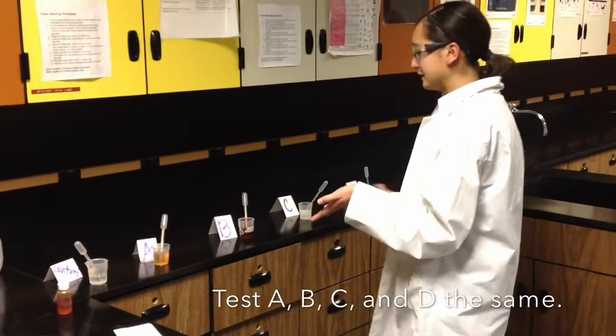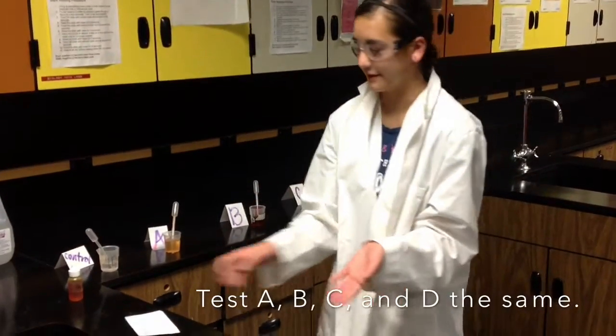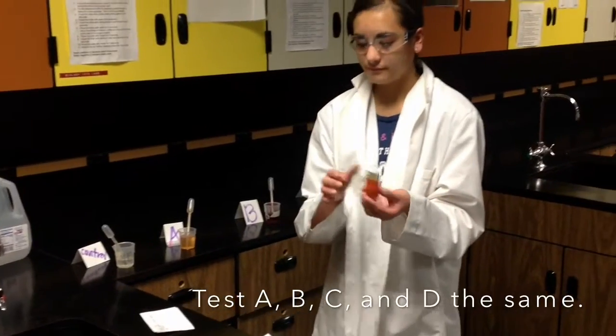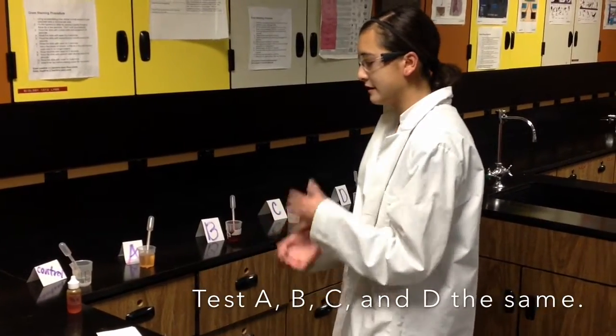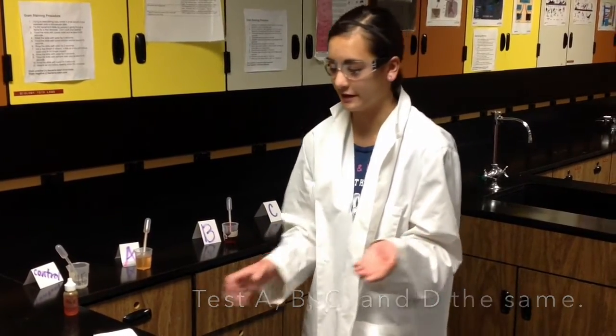For products A, B, C, and D, you'll take one drop of each product and put it on the slide, then add the reagent. If it turns black, there's alcohol in it. If there's not alcohol in it, it won't turn black.